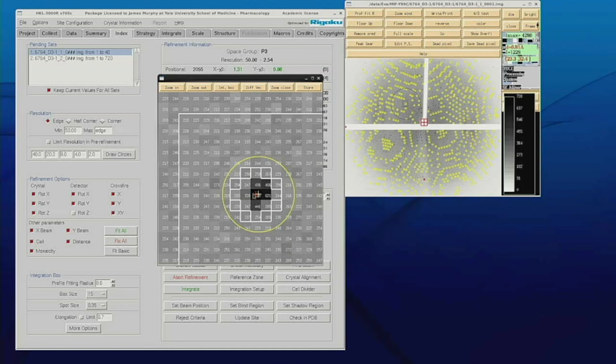So these pixel values are added up, and then the background is this part of the box out here. There's a formula where we add up all the pixels here and subtract the background to determine what the intensity for that particular peak is, and that one is 513.5.